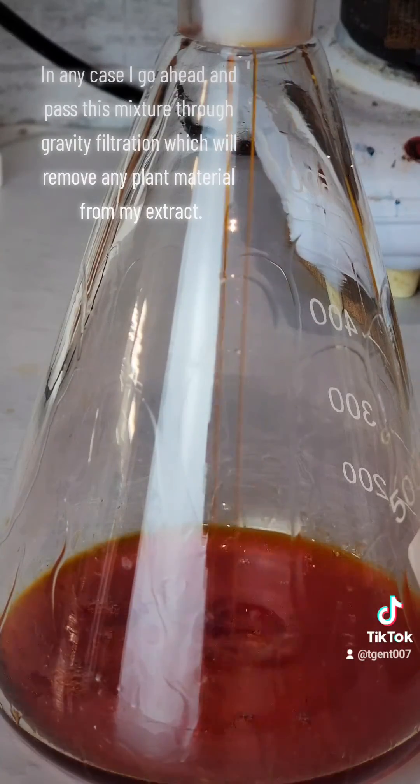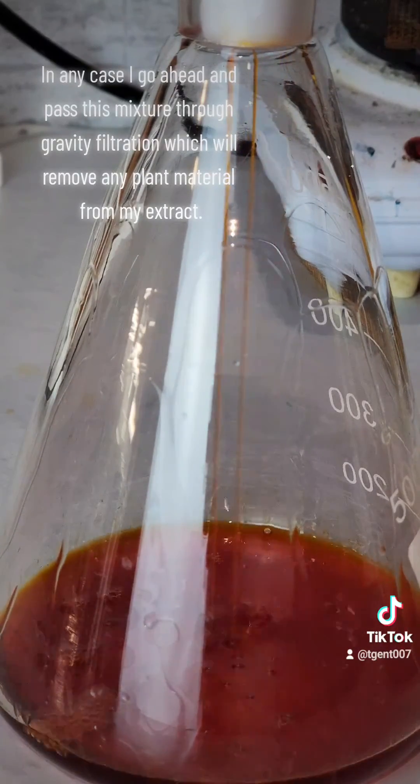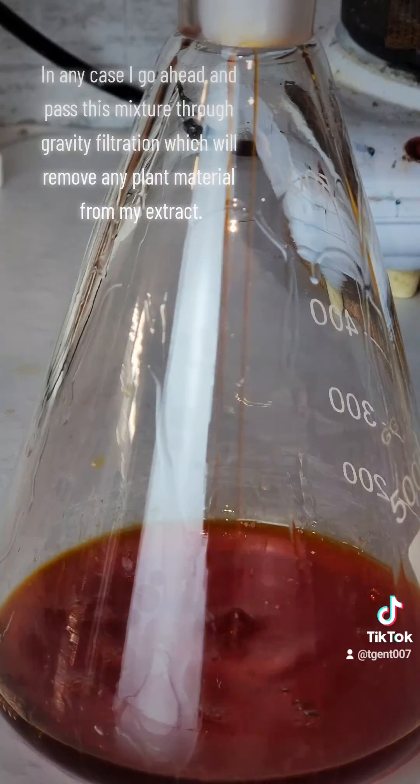I go ahead and pass this mixture through gravity filtration, which will remove any plant material from my extract.